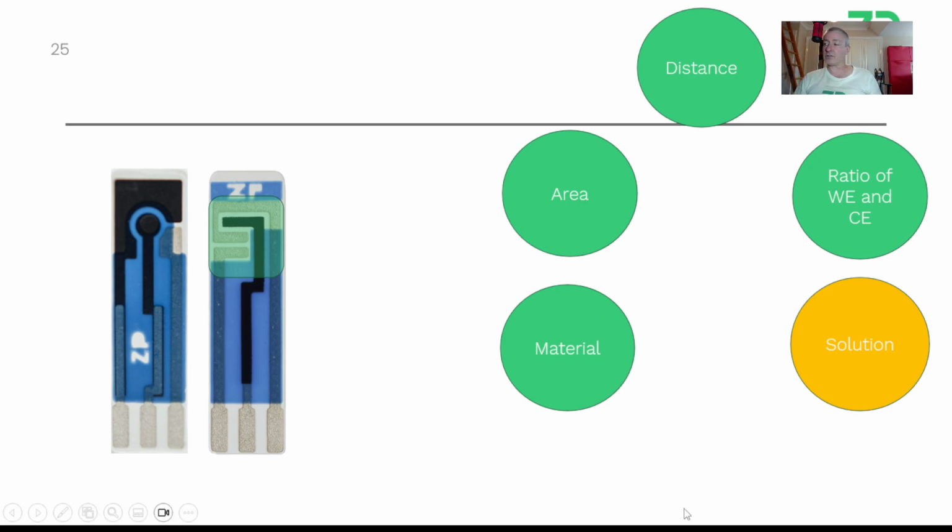So you do have a control on that compliance voltage. And then just to say, current: if you're putting assays on electrodes, like putting membranes down, that will often end up reducing the current on the electrode, and by reducing current on the electrode, you'll end up improving the situation with the compliance voltage. So what am I saying here very quickly?